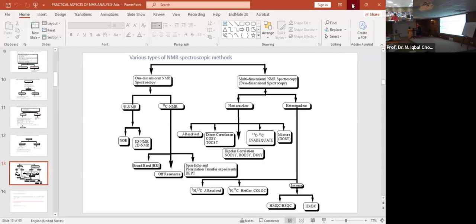Yes. Calculation of constant sensitivity of carbon. I used Mestrenova and noticed that it gets 151 instead of 150 from 600 megahertz. I don't know why. I have never used Nova. I always use TopSpin, but whatever is written on your spectrum, this is the frequency that your nuclei is facing.